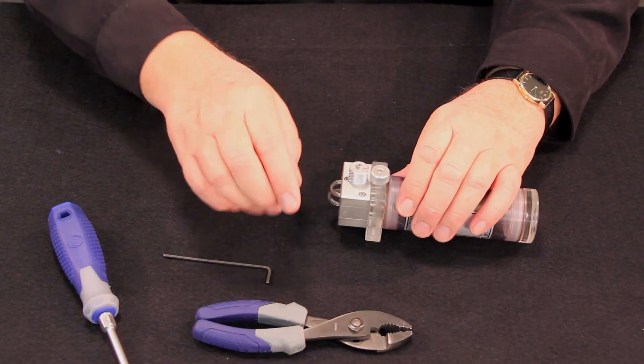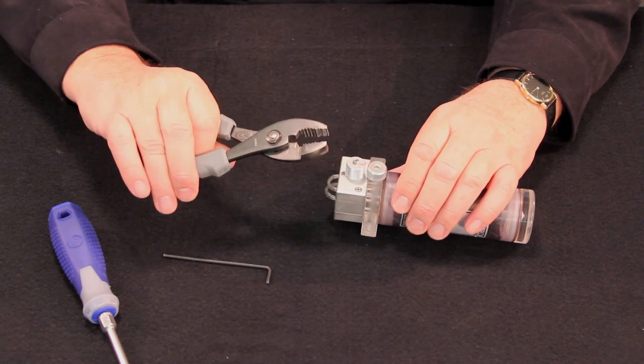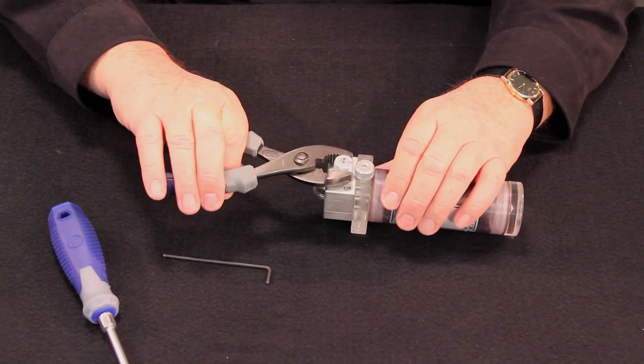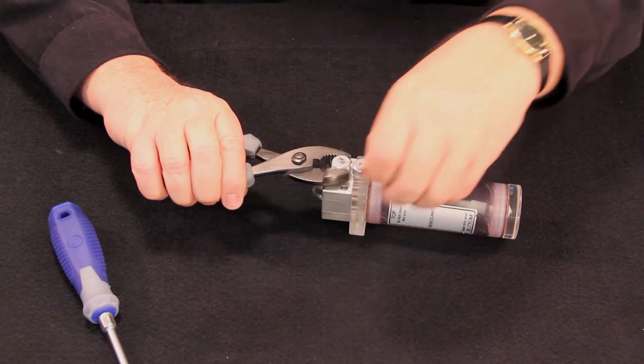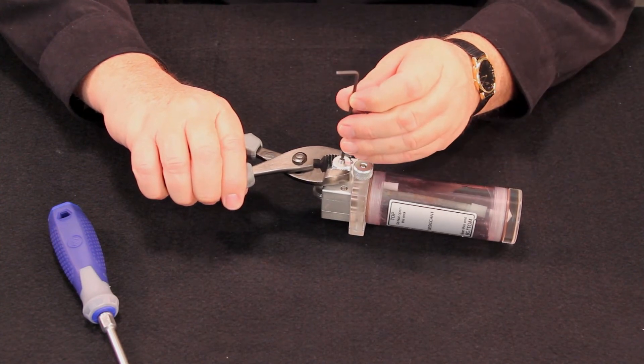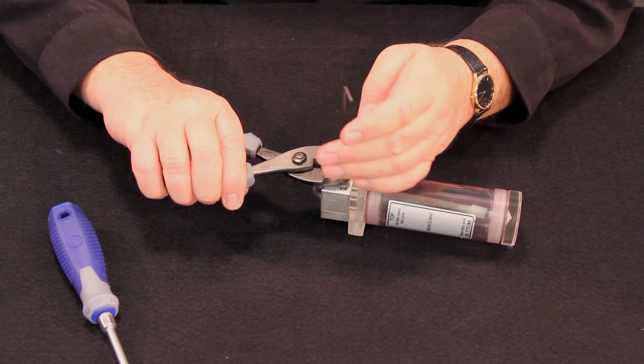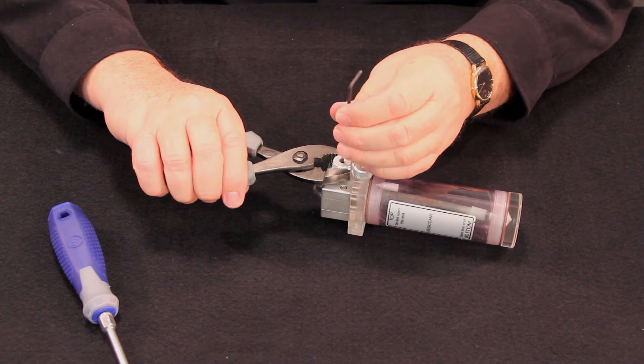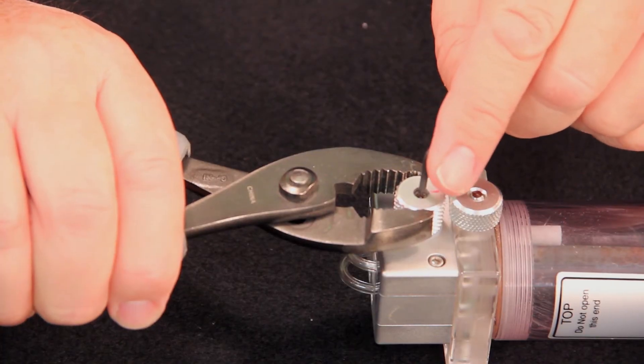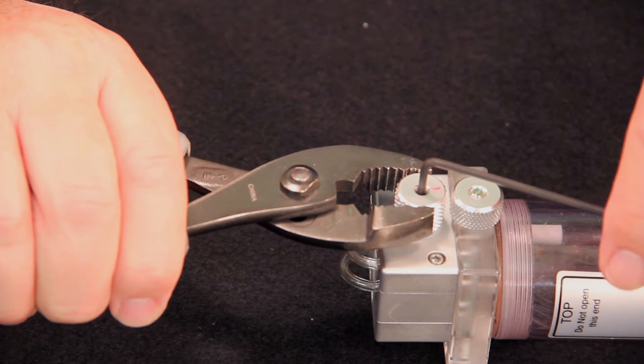Now, you can hold the knob in position with the pliers and tighten the set screw. The set screw needs to be firmly tightened.